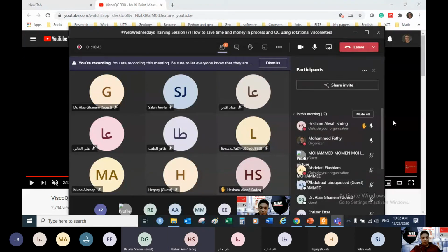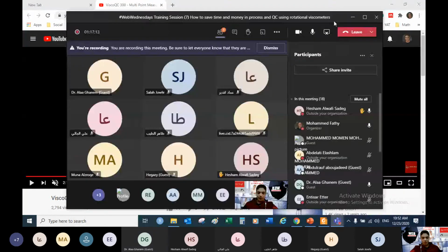I didn't hear the question. Is the rotational viscometer applicable to crude oil? Yes, of course. All right, Mr. Hisham, I hope you got the answer. Thank you, and thank you Dr. Ala.